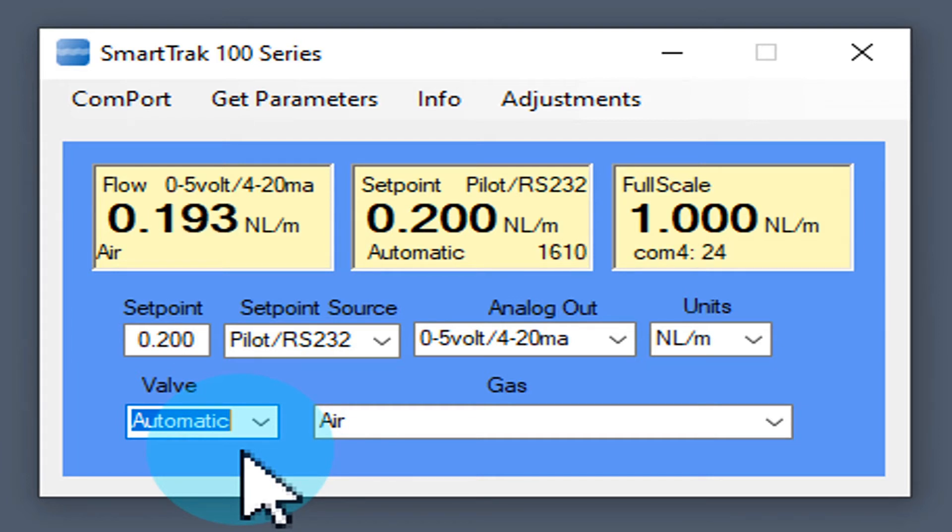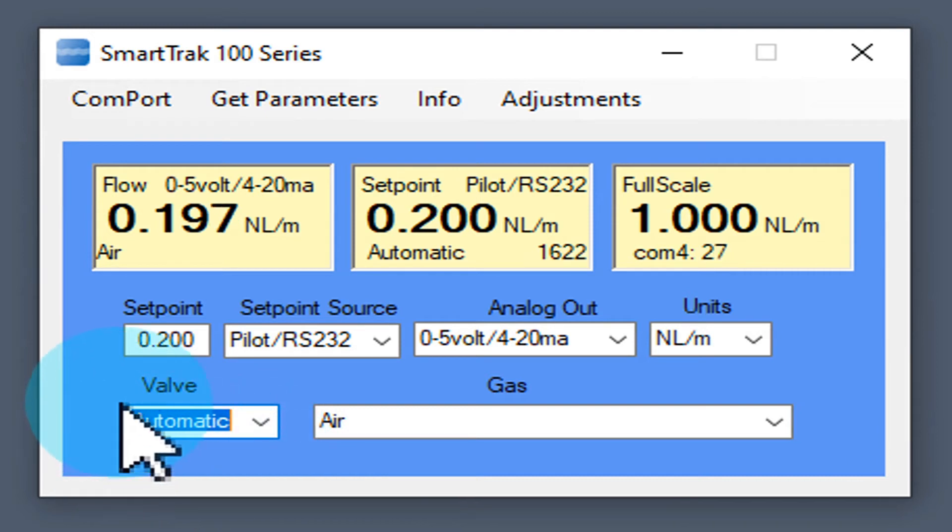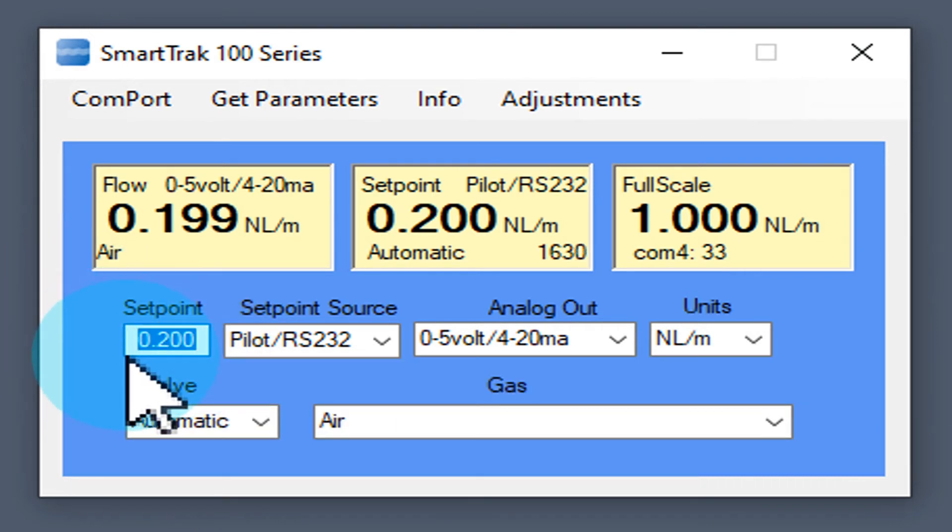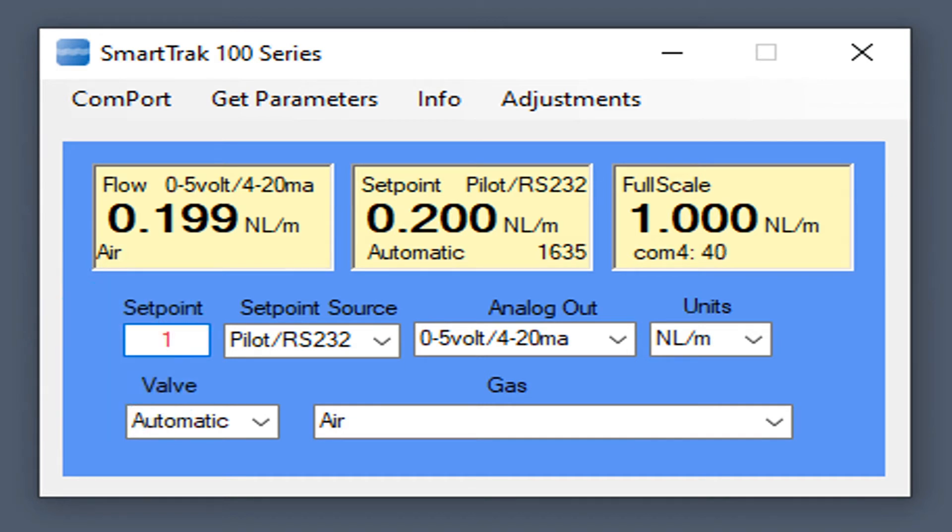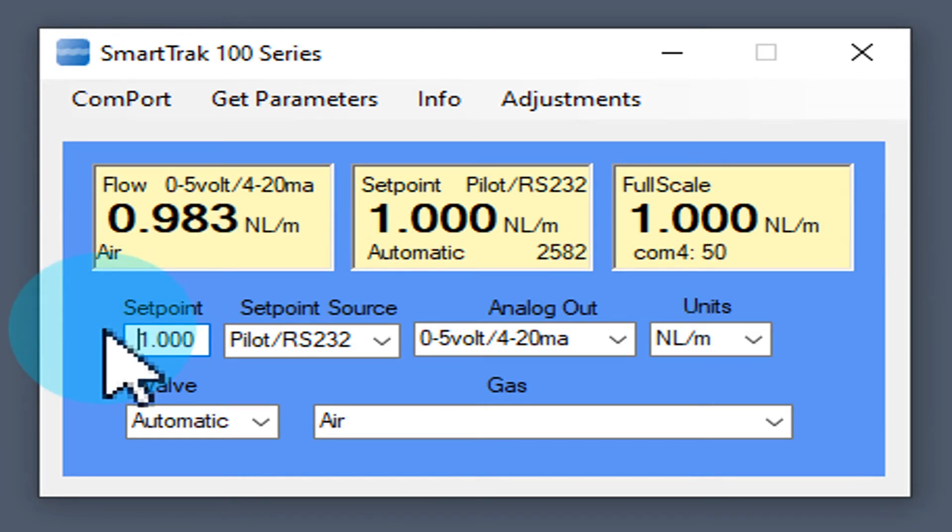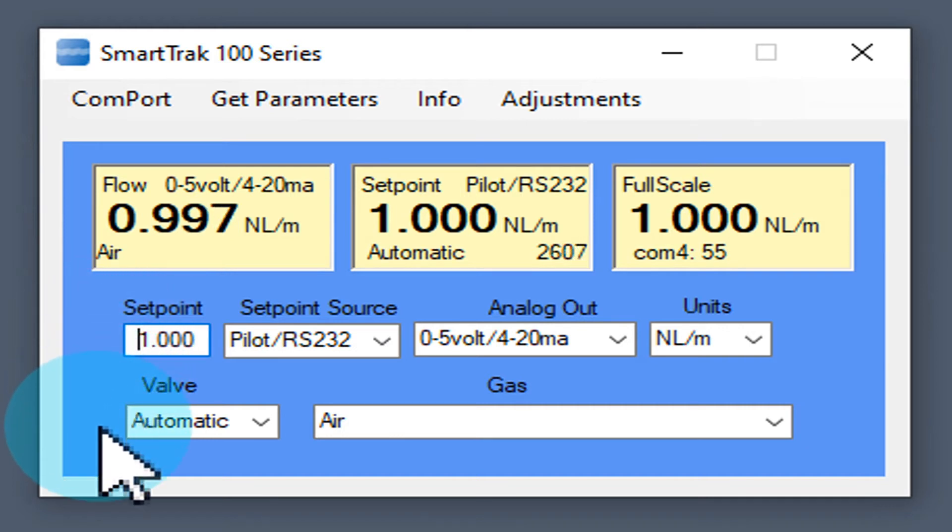In this case 0.2 liters per minute was already preset. You can now change the flow by clicking into the setpoint field and adapt the setpoint value to your desire. Press enter and the flow now increases to the value set. This will be shown in the actual flow window.